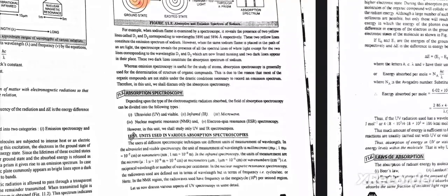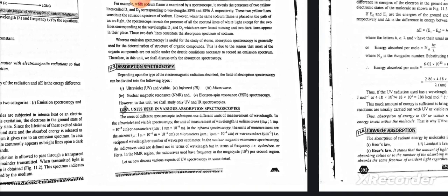These two dark lines constitute the absorption spectrum of sodium. Whereas emission spectroscopy is useful for the study of atoms, absorption spectroscopy is generally used for the determination of structure of organic compounds. This is due to the reason that most of the organic compounds are not stable under the drastic conditions necessary to record an emission spectrum. Therefore, in this unit we shall discuss only the absorption spectroscopy. So the main topic is absorption spectroscopy.